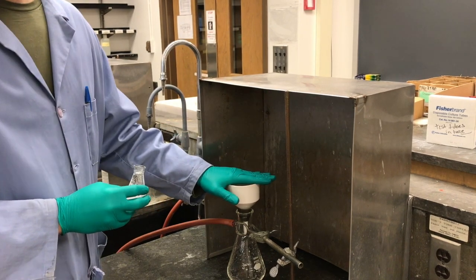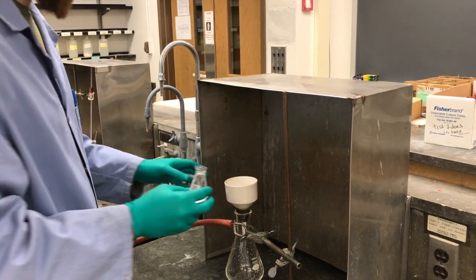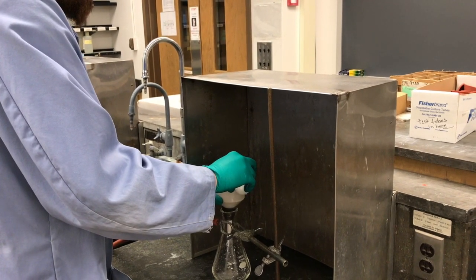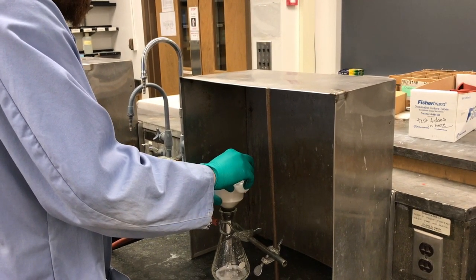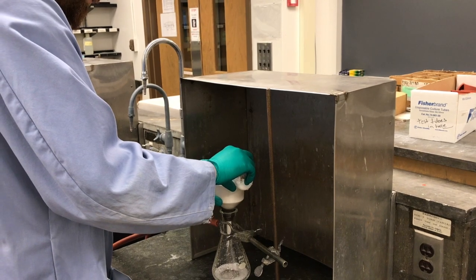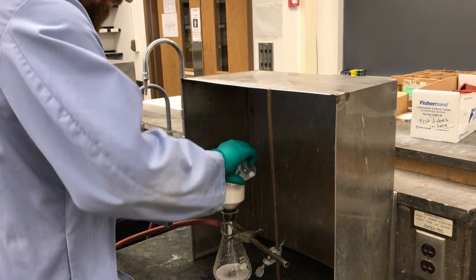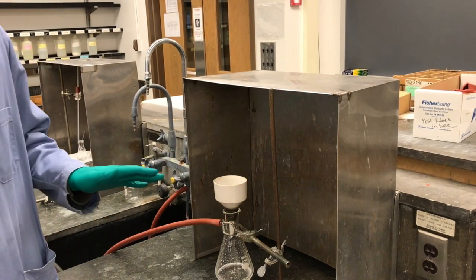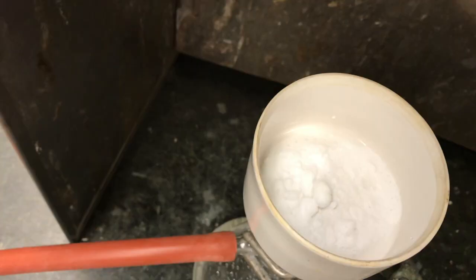So I've wet the filter paper with a little bit of deionized water to keep it in place. And I'm just going to carefully pour into the center of that mass. Now I'm going to let this dry under vacuum for a couple of minutes.